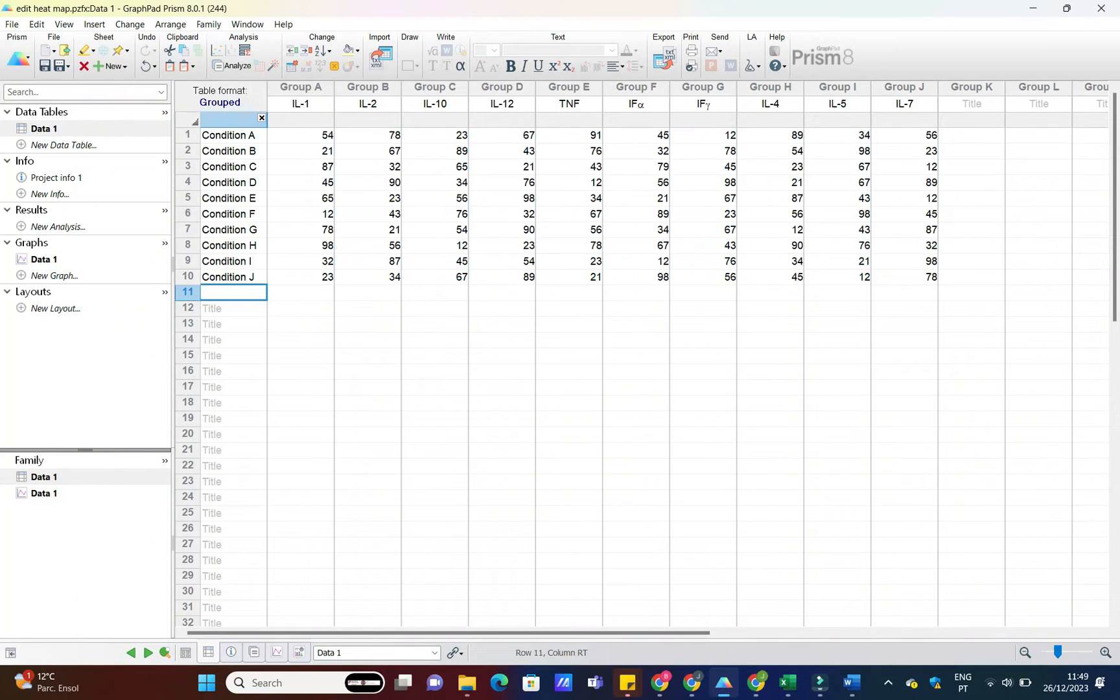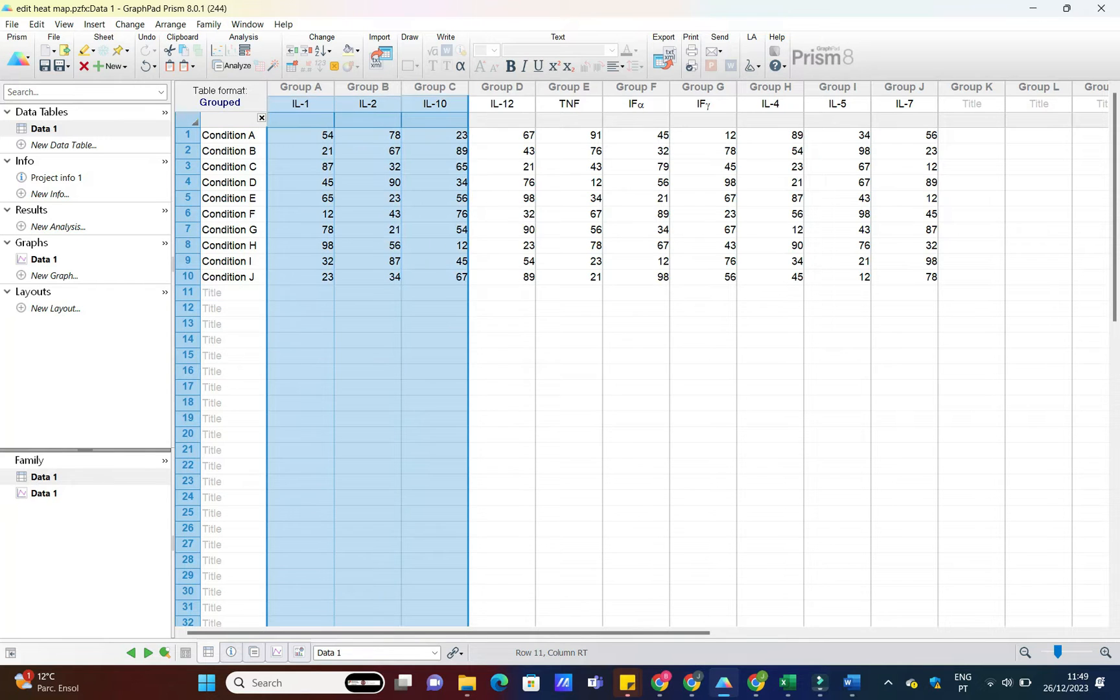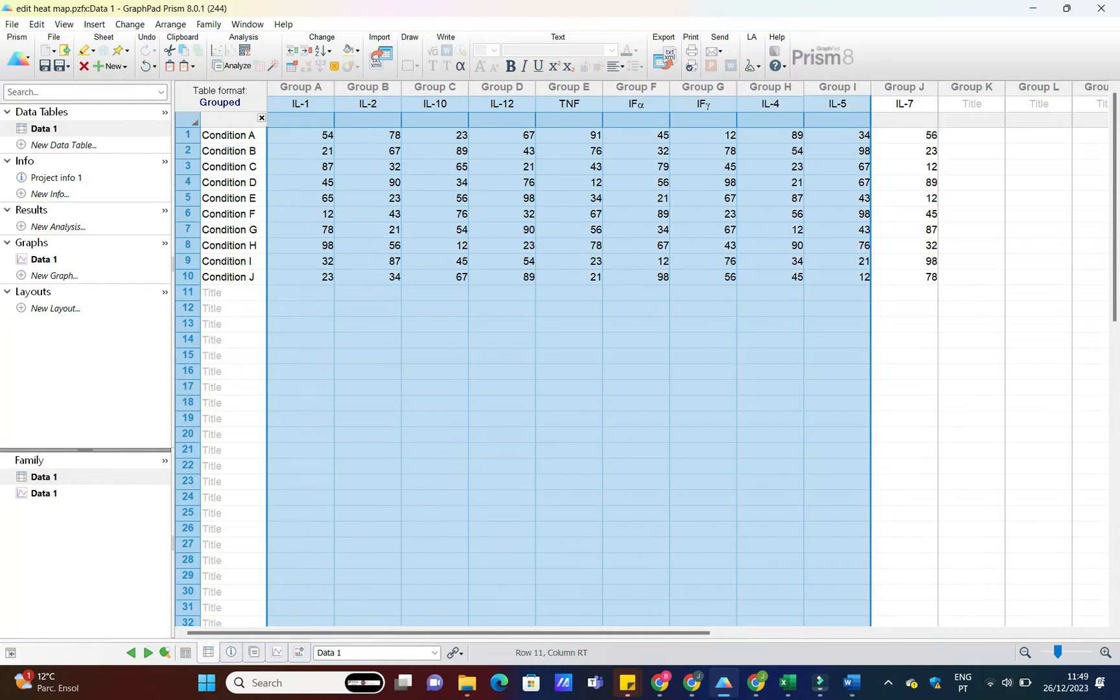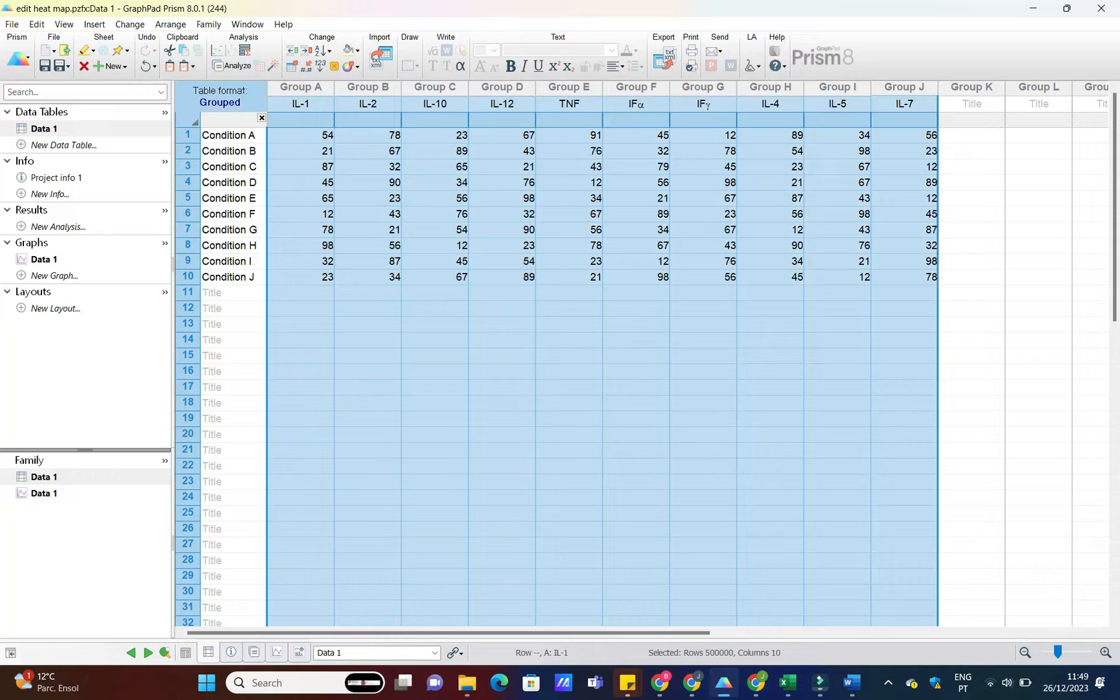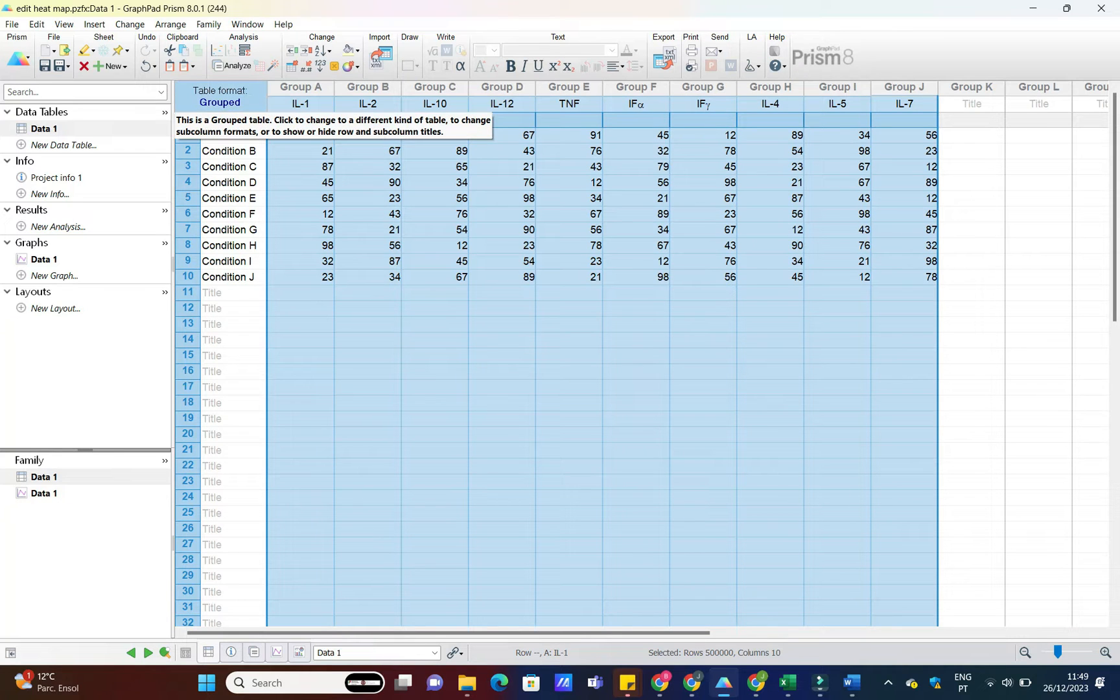The first step is, of course, importing your data into GraphPad Prism. Make sure your data is organized in a way that suits your analysis. Once you've got that sorted, importing is a breeze.